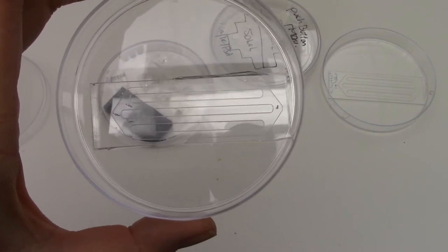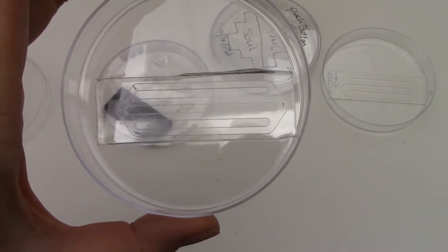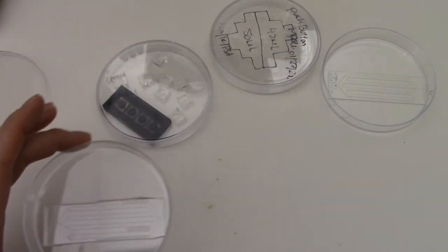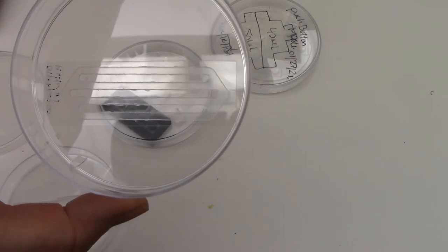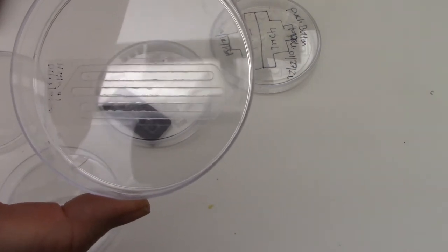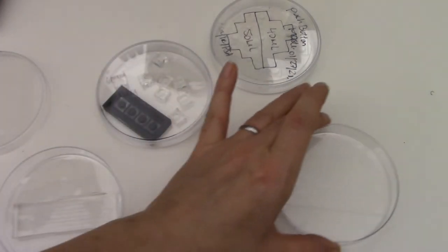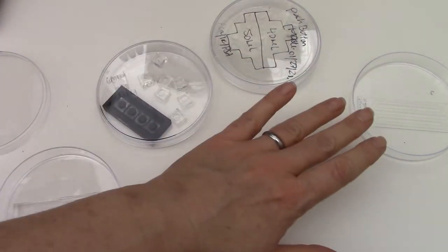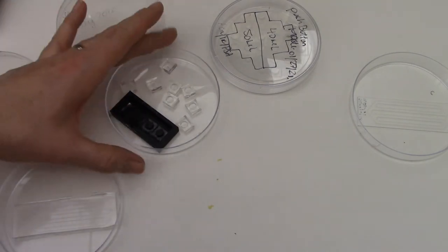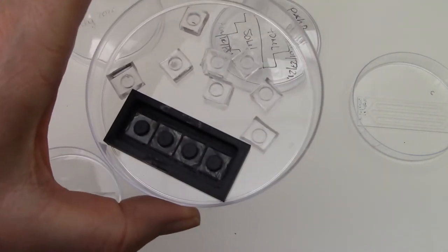This is an example of a final PDMS chip. This is an example of the laser cut mold that was used to make this chip. You can make molds out of a variety of different materials. As I mentioned, this one was laser cut. You can also 3D print your mold.